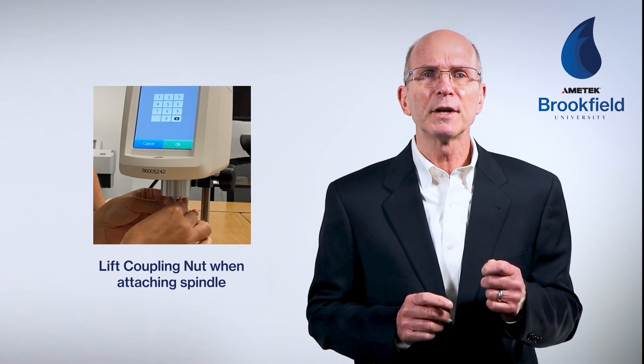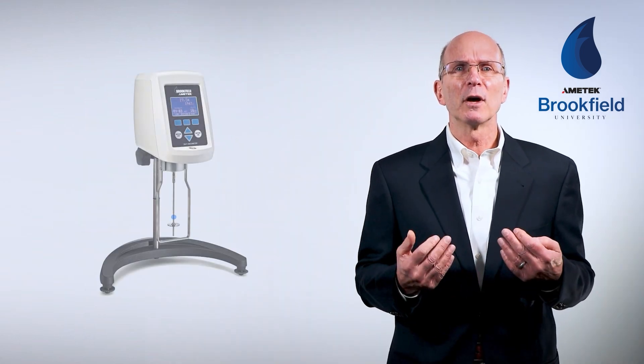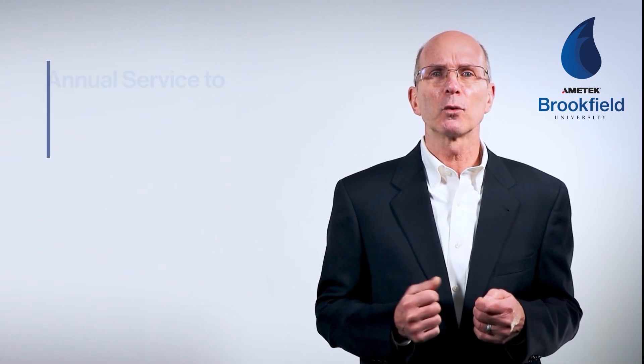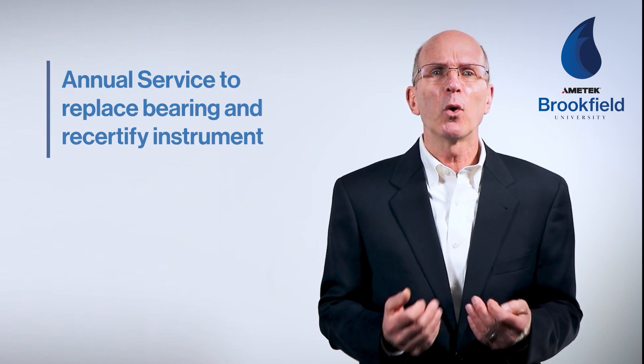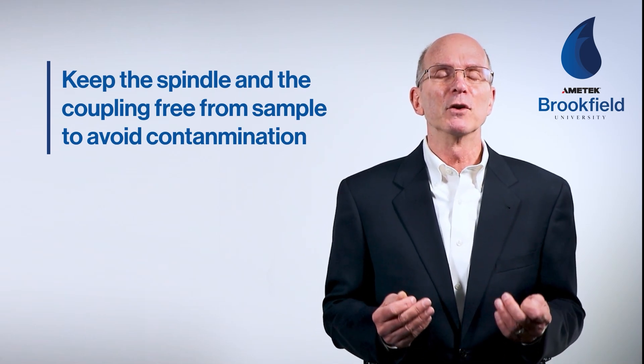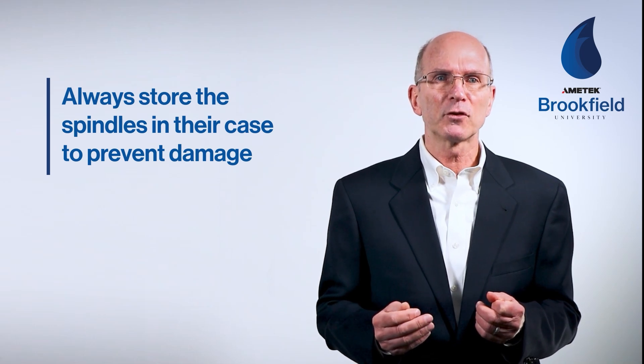Taking proper care of your instrument can prevent damage that might result in loss of accuracy. Care should be taken when attaching or removing spindles — always lift the coupling nut and hold it up, which lifts the point away from the jewel and prevents bearing damage. When a spindle is attached, avoid putting any lateral pressure on it, as this could damage the suspension and bend the shaft. Keep the spindle and instrument coupling free from sample contamination, which can lead to misalignment and sometimes prevent spindle removal. Store spindles in their case to prevent damage, as bent shafts and nicks or dents can affect test results.